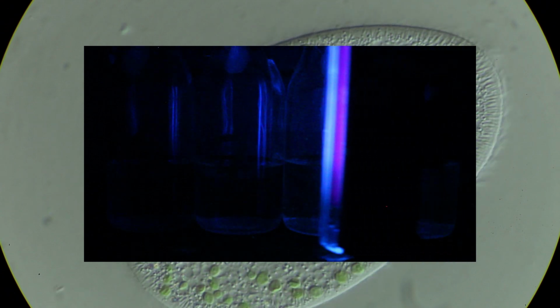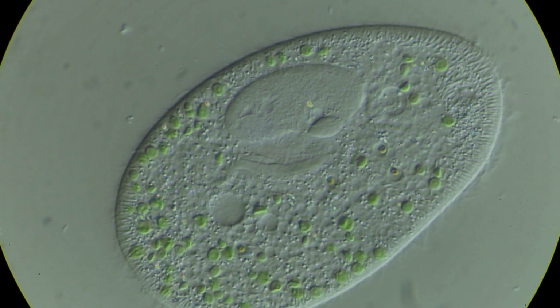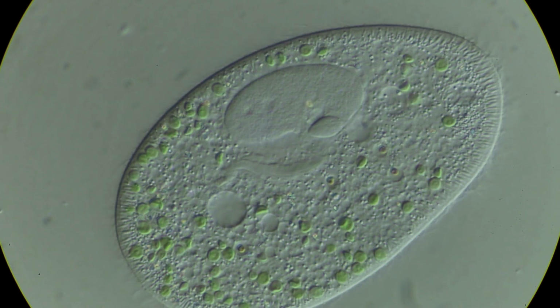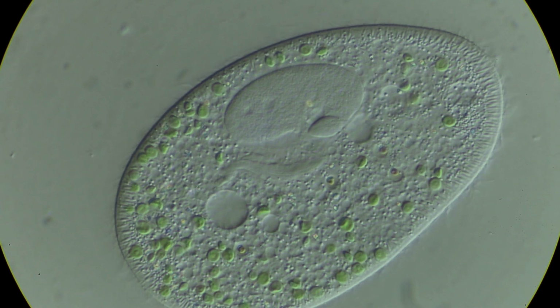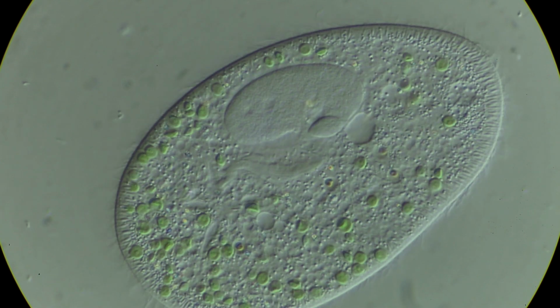It's important to note that not all chemicals, organisms, etc. require external sources of fluorescence, as they are autofluorescent or self-fluorescent. This means they're able to shine themselves so long as you put light into it that will stimulate this process. For the most part, this isn't an example of that. This nearly always involves an external and artificially generated fluorescent compound.